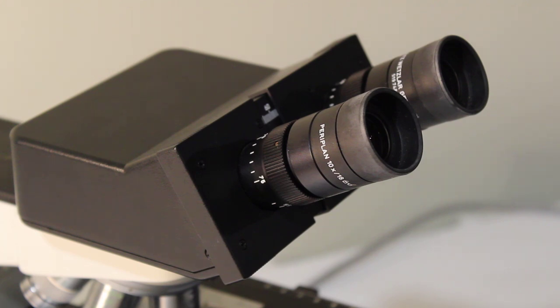Alright so that's the quick tour of the optical components of your microscope. Please join me in episode 3 for a discussion of how to focus on your sample and change magnifications.